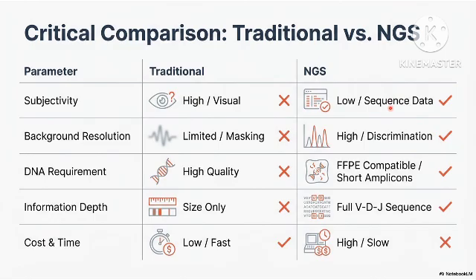The background is limited here. The background is high here. You can very well discriminate the background from the true clonal peaks. So background resolution is high, discrimination is good.